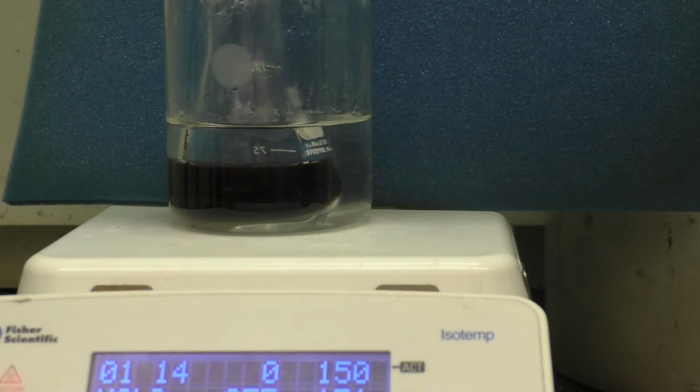So we've let this go for a while. We'll go ahead and do another filtration, see if we're any better. If we're not, we're just going to carry this forward.